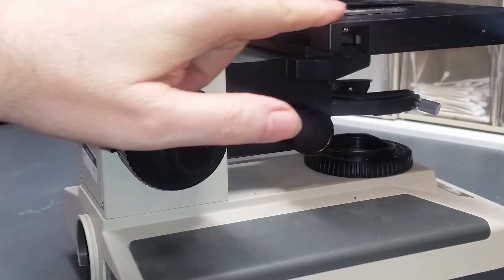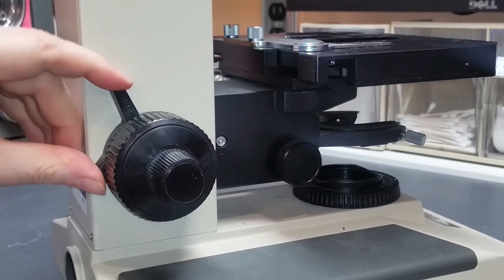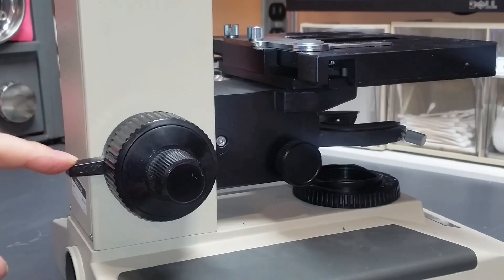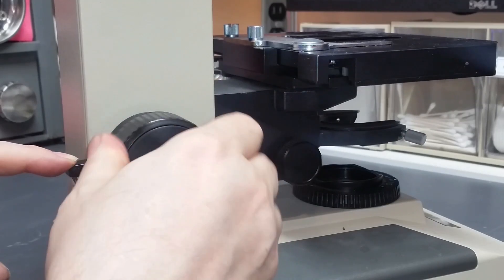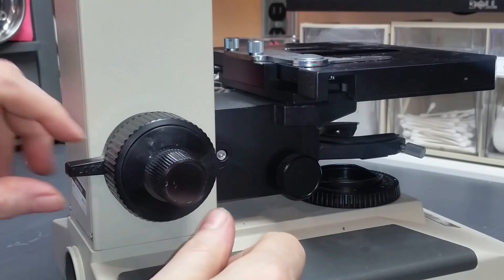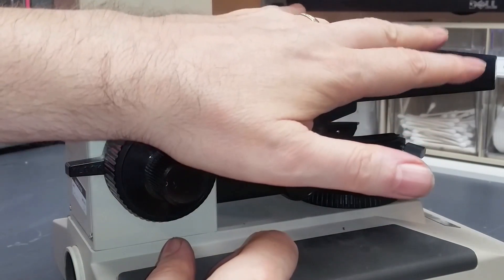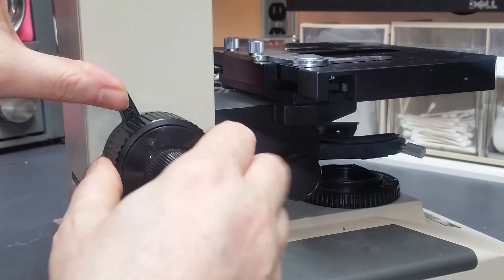It's a mechanism that limits the height adjustment of your stage. If I release this knob by turning it counterclockwise, I can — with some effort since it's very stiff — raise and lower the stage. For normal operation, the intent of this preset stop is such that you could put a slide on the stage, go through and get everything in focus, and everything's ready to go.